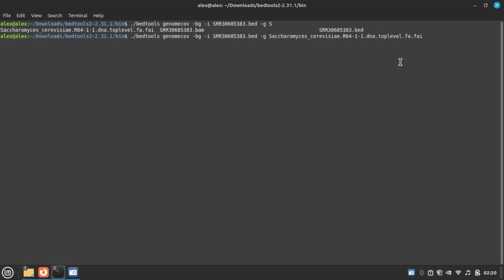So for that I am going to use greater than and one break, after that tee, and here I am adding the file name genome coverage .txt. So it is the total script for making the genome coverage with the help of this BED file. Let's enter.